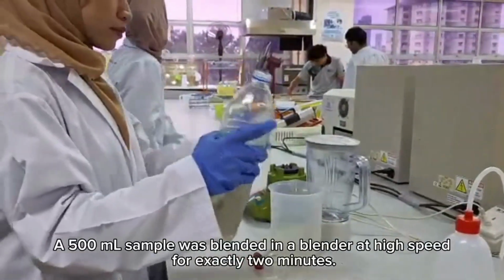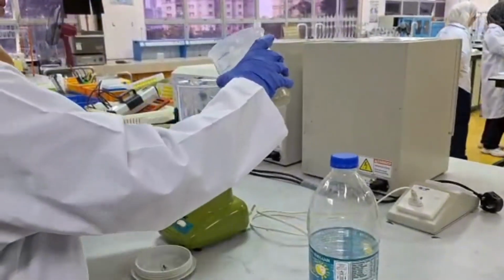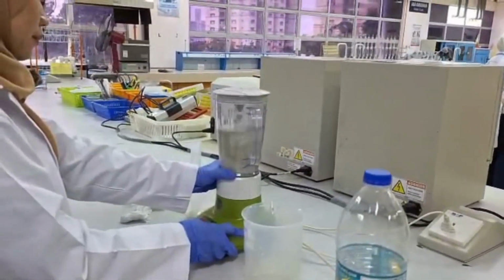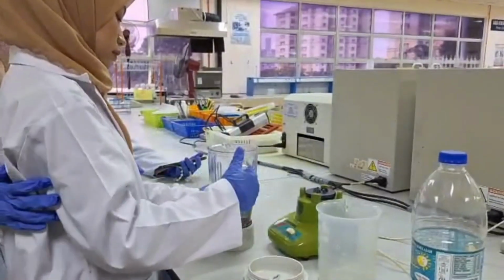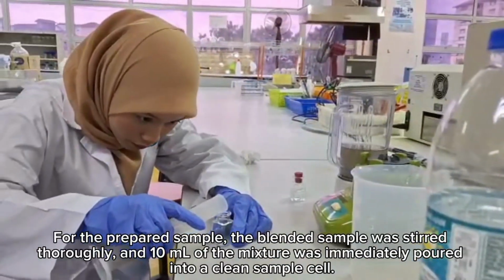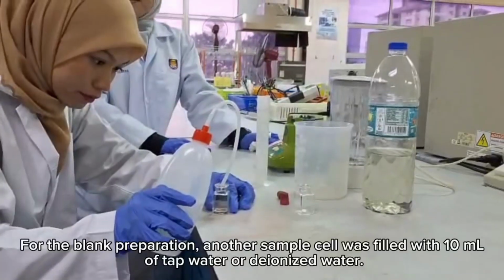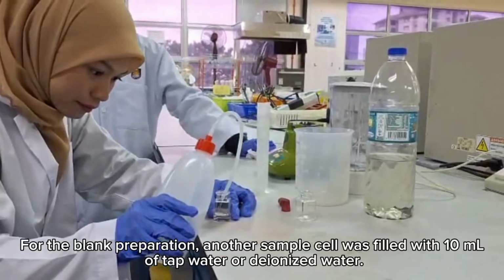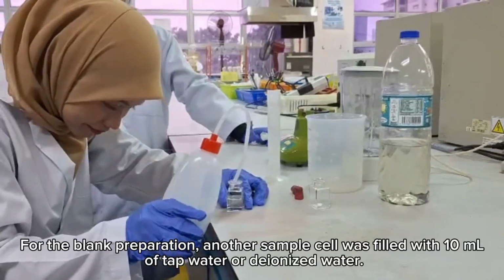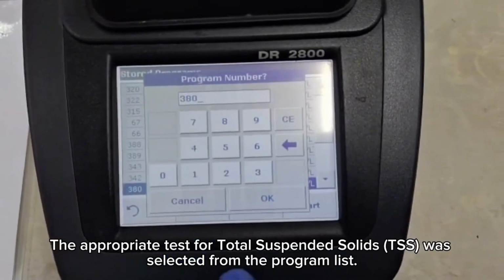A 500 milliliter sample was blended in a blender at high speed for exactly 2 minutes. For the prepared sample, the blended sample was stirred gently, and 10 milliliters of the mixture was immediately poured into a clean sample cell. For the blank preparation, another sample cell was filled with 10 milliliters of tap water or deionized water. The appropriate test for total suspended solids, TSS, was selected from the program list.